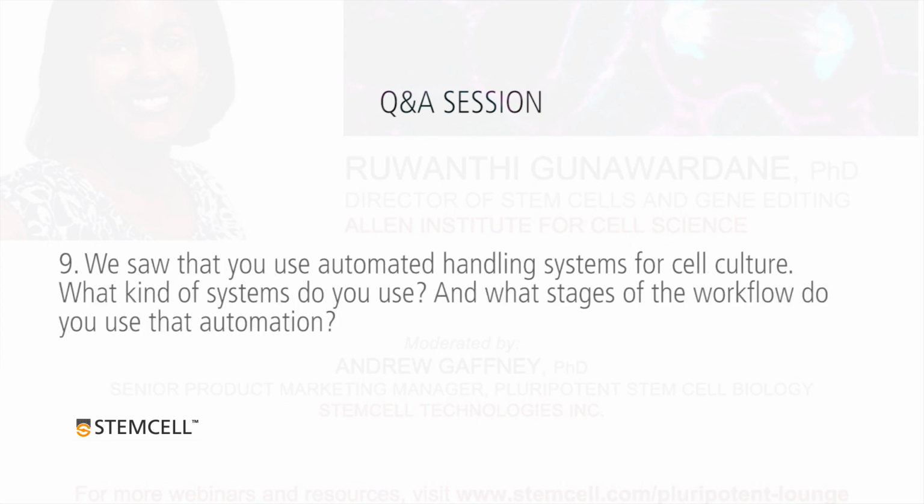Okay. We saw that you use automated handling systems for cell culture. What kind of systems do you use, and in what stages of the workflow do you use that automation? Good question. So my group, the stem cell and gene editing group, does not use automation, but the microscopy group, just like I was answering the previous question, is starting to build automation into their workflow. And what they have is a Hamilton. I don't know the model, but it is a Hamilton robot that has an incubation system.